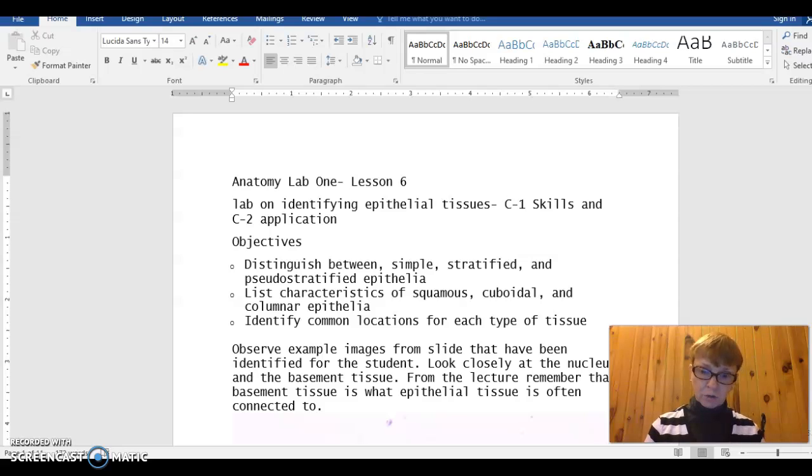And I would have shown you little pictures from a projecting microscope of what the simple epithelial tissue looked like in the squamous tissue, cuboidal, columnar tissue, etc. And then it would have been your job to take the slides and one at a time focus in on them and identify whether it's simple squamous, stratified squamous, simple cuboidal, stratified cuboidal, pseudostratified columnar, which is the ones that aren't all straight, nice columns. There are some in-between pieces that are columns, but not that nice, straight, complete piece.